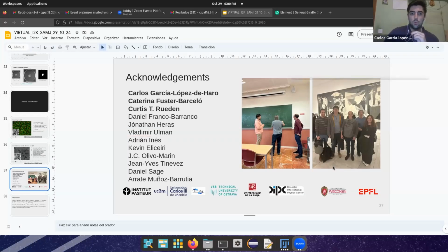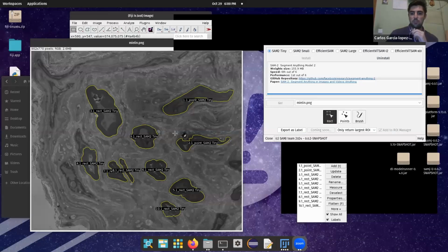Okay, so what I think is that, unless you are Meta or Facebook or Google, you shouldn't try to fine-tune your own SAM. If you want to create a deep learning model for your specific data, my opinion is best to just use a simple UNet, a CNN, ResNet, or whatever, and then use these kinds of tools to annotate the data, because your model is going to be as good as your data.